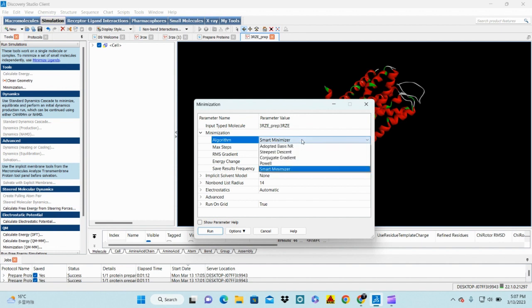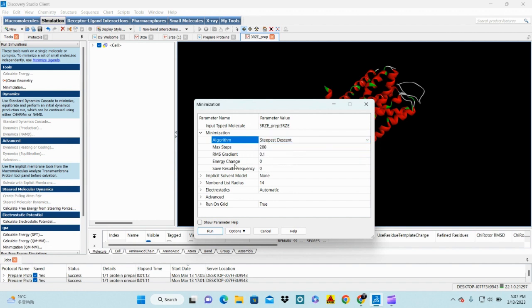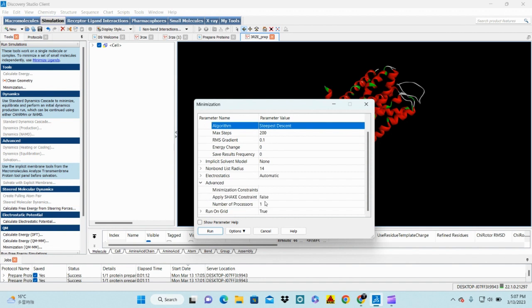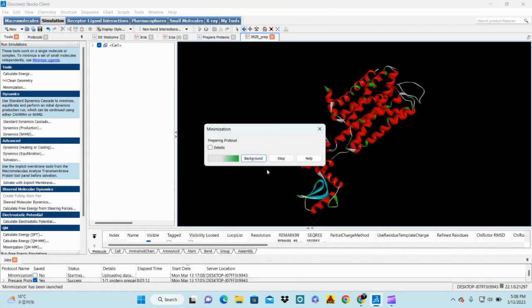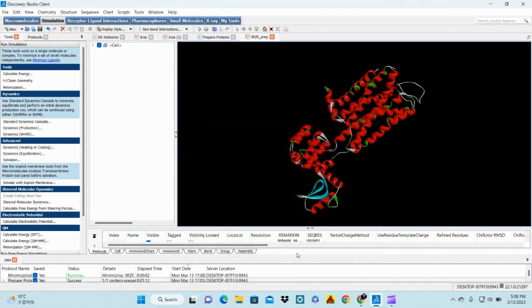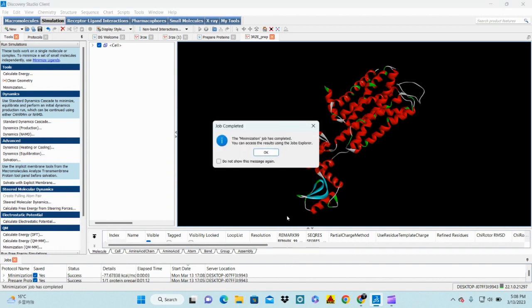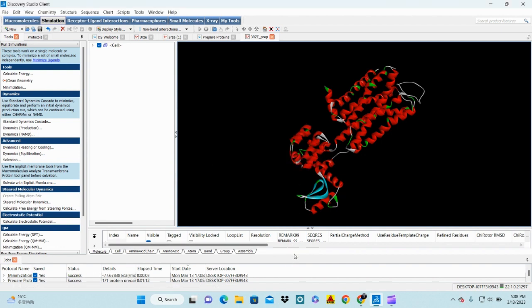To get a more stable protein structure, you need to perform minimization in two steps. The first step uses Steepest Descent. Click on it, check that everything is okay under Advanced settings, then run it and put it in the background.